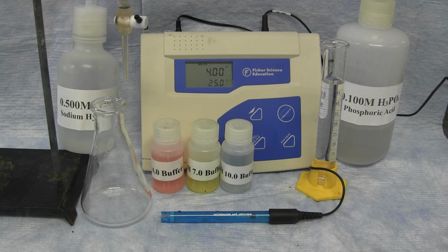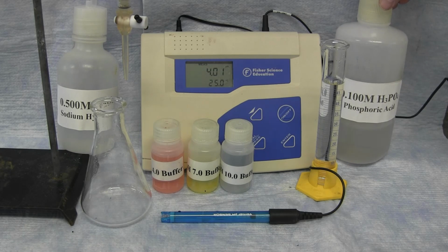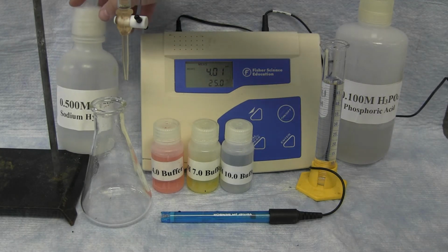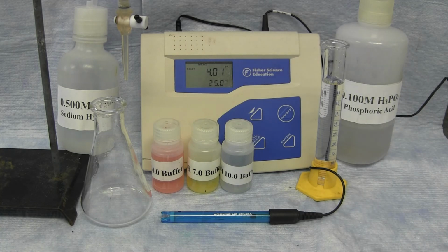In the experiment, you're going to be preparing a titration curve of phosphoric acid. You're going to be titrating 0.1 molar phosphoric acid with 0.5 molar sodium hydroxide. You're going to be measuring the pH of the combination of the two with every milliliter of sodium hydroxide that's added.